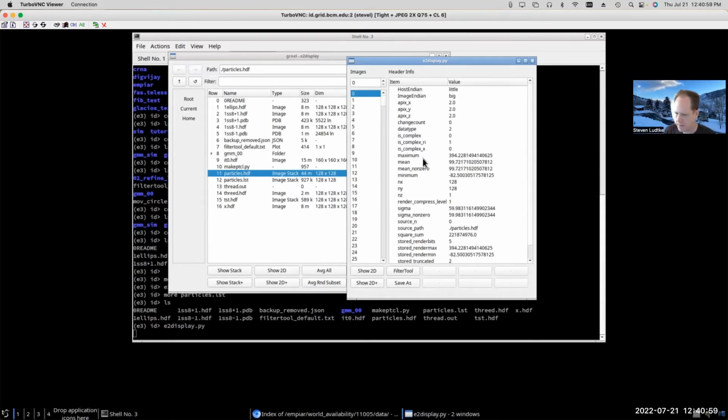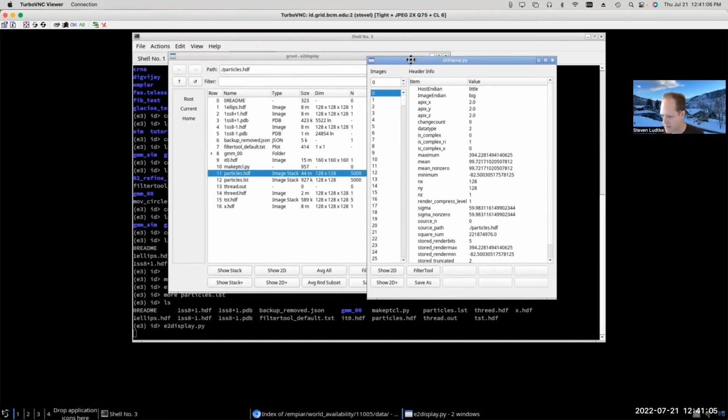But if we think about storing information about, say, the particle orientation along with the header of each particle, we could do that. You know, we could take particles.hdf and we could store the particle orientation and the defocus and all that stuff directly in the header of the image. But that would mean that every time we ran a refinement, it would be modifying the data in the header.